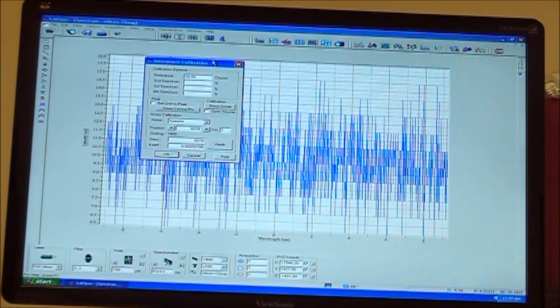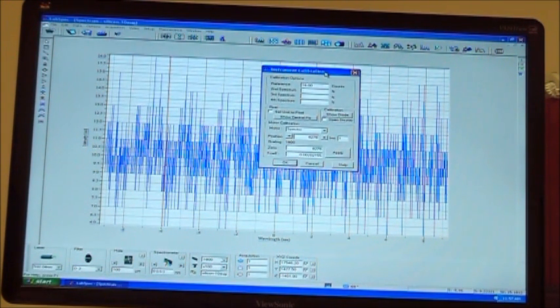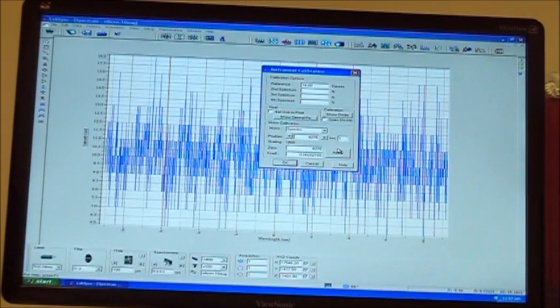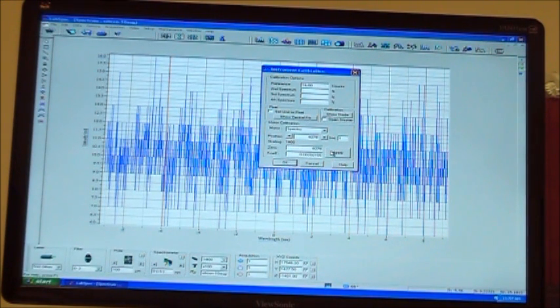So to do the 2-point calibration, the first thing you would do is go to 0 nanometers and check the laser line. And you would alter the laser line position by using the 0 coef here. If the laser is a little high, a little low, you just slightly alter the number here for 0, and you click apply, and you will see the peak shift, left or right. And you would keep changing it and applying until your 0 peak fell on 0.